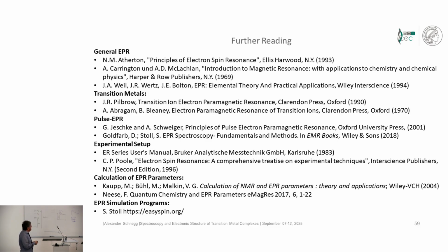There are different EPR simulation programs. I listed here Stefan Stoll's EasySpin homepage as further reading, because the description and the literature and the insight you get on EPR just by reading this homepage, I also found quite useful.